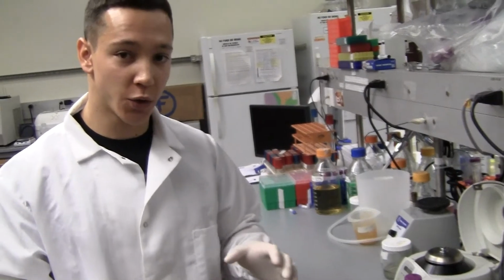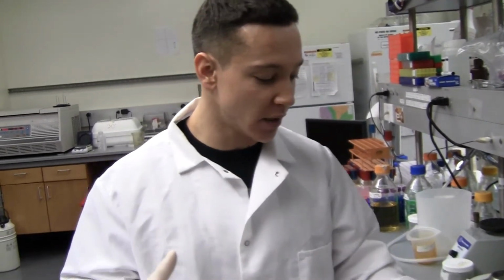So we're going to spread our E. coli plus or minus arabinose, and then add phage. And we're hoping to see that minus arabinose, T4 kills a lot of cells, plus arabinose, we get that IM gene, we don't see that. So that's kind of the core of the experiment.